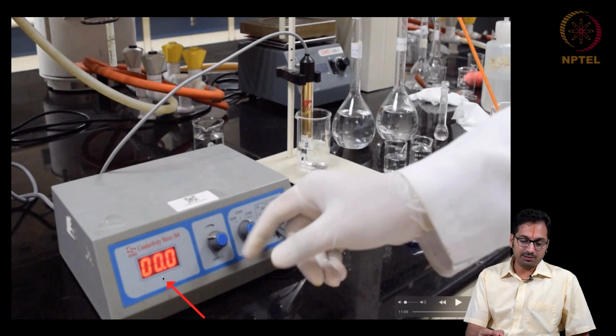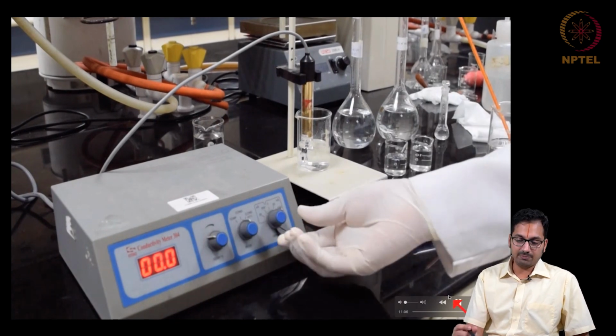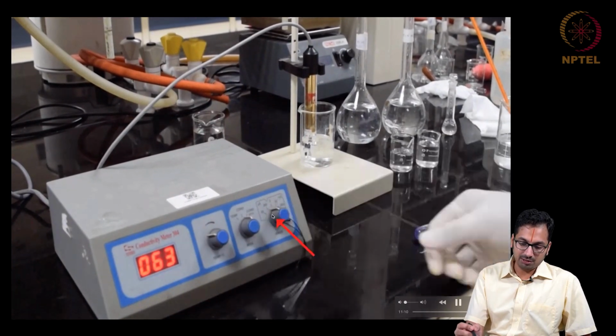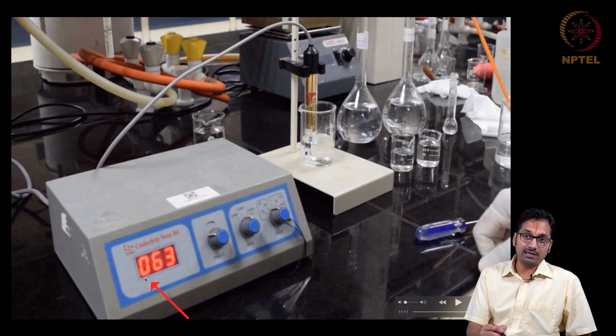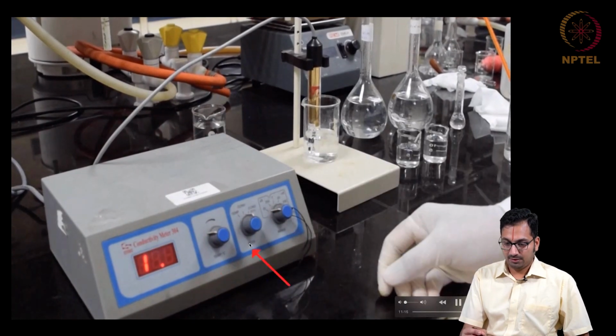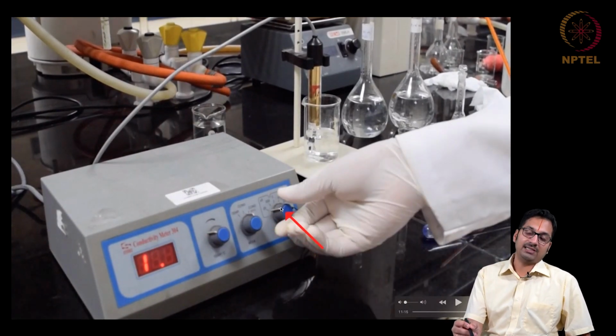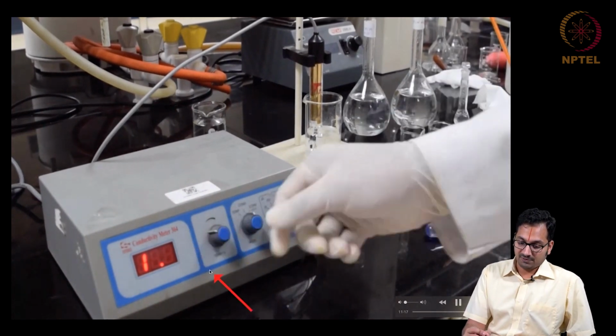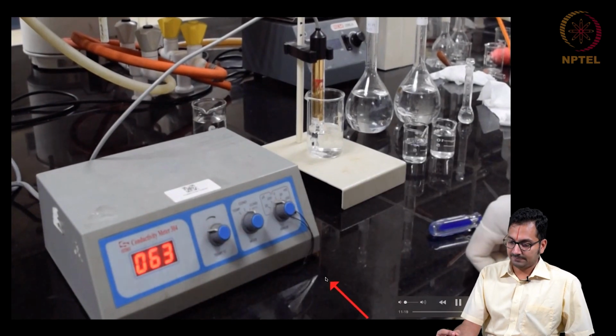When you have only pure water, there is no conductance that comes. Of course, there will be a small amount of conductance, which the scientist is able to read after changing to the 200 microsiemens setting, and he is able to read about 63 microsiemens. Okay, now that is done. He is just trying to show you that if the setting is kept at 20 microsiemens, you do not read anything proper. So whenever you do not read anything proper, check whether your instrument is carefully kept at the setting that it has to be kept in. Okay, so now that is done.